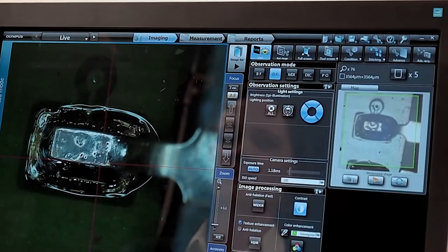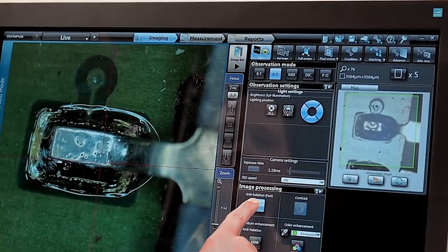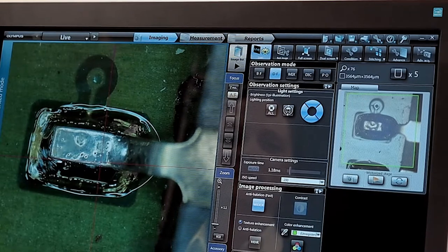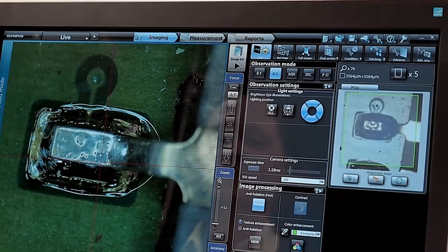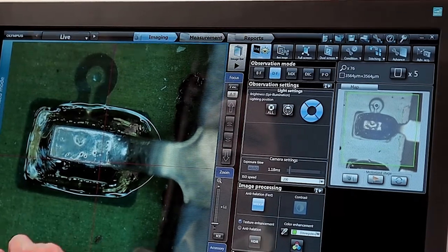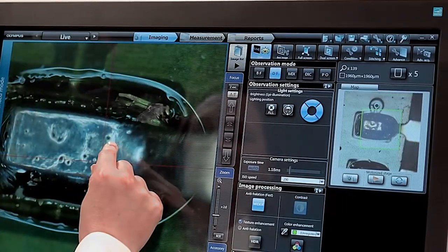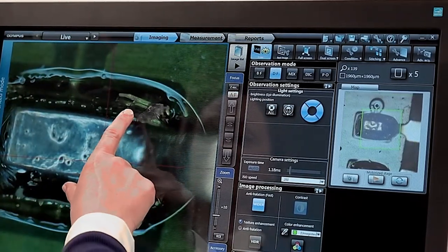The patented wider function uses advanced image processing to take care of contrast issues and make textures stand out during live observation.